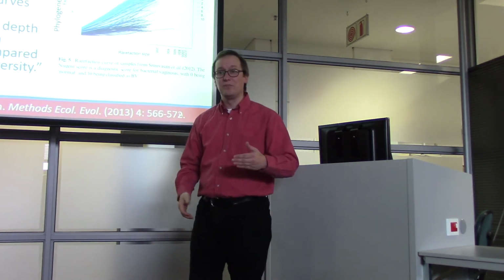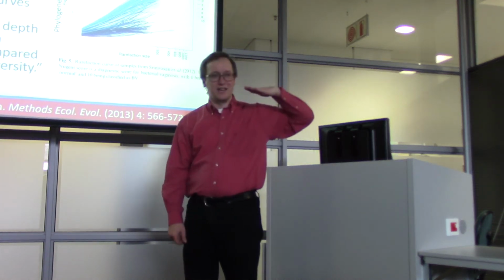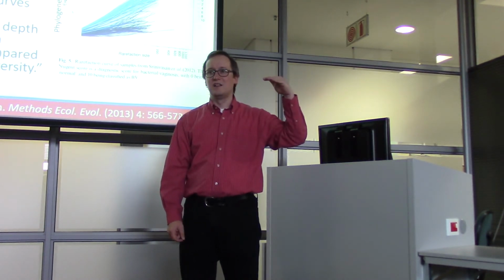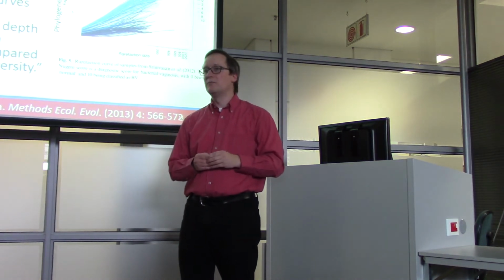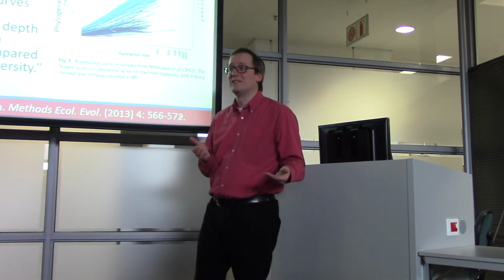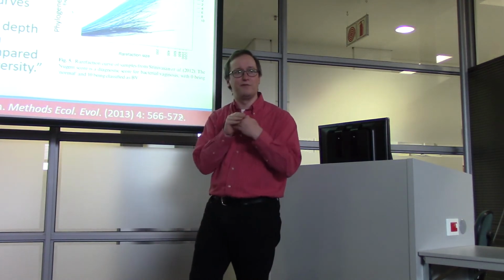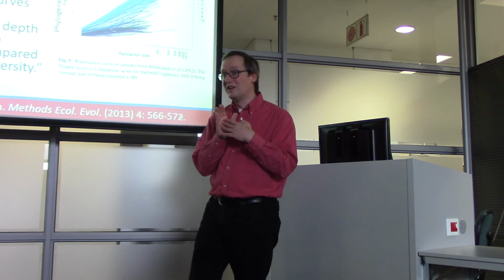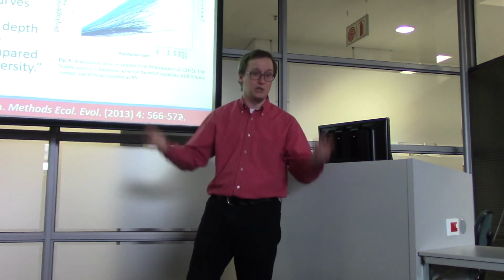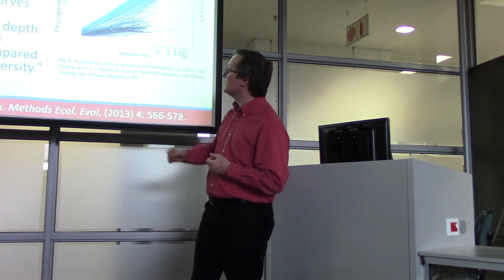So ideally, you would like to see that the curve has gone asymptotic, that we have a pretty stable number of species, that even if we doubled the sequencing, maybe the number of species would rise by 10%, but not much more than that. That would be great. If you see that the value is just streaking upwards as you get to the full set of data you produced, you can probably have produced twice as many sequences and produced a much, much larger phylogeny as a result. So rarefaction curves are for that purpose.